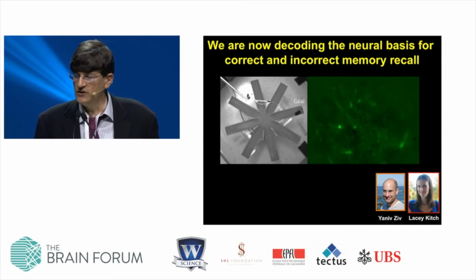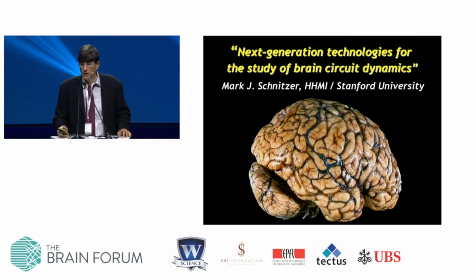Meanwhile, we can visualize the ensemble dynamics in the CA1 hippocampal network. Okay, now in the closing moments, I want to give you some glimpses of new techniques that may be coming over the horizon to help us study problems of the kind that I've been illustrating.